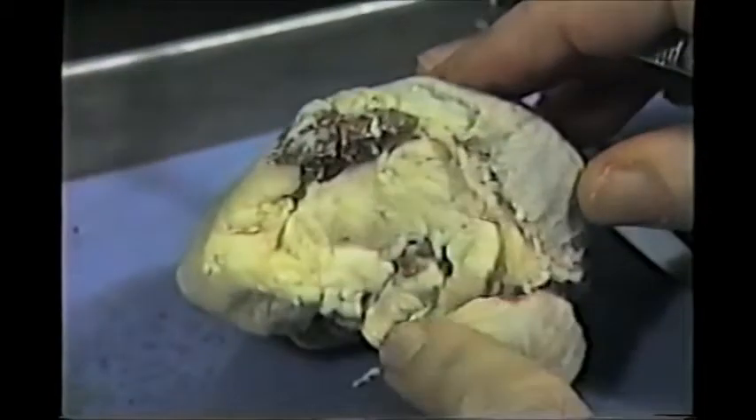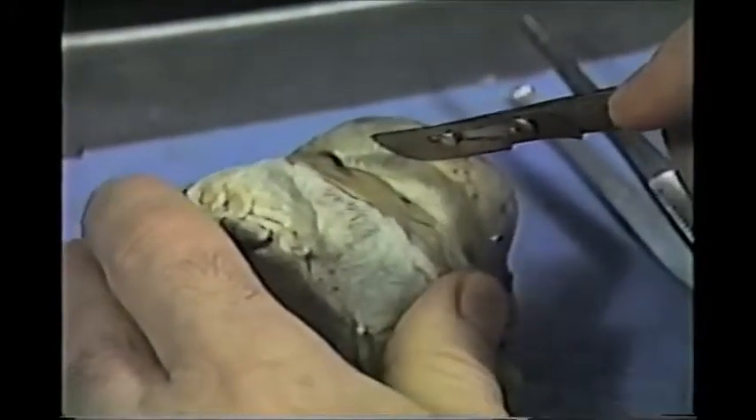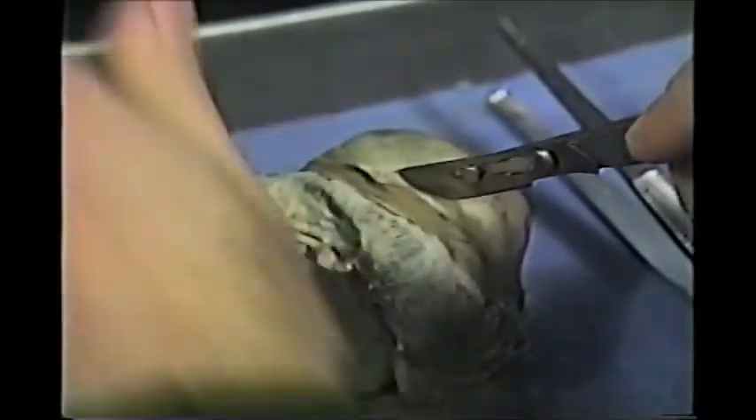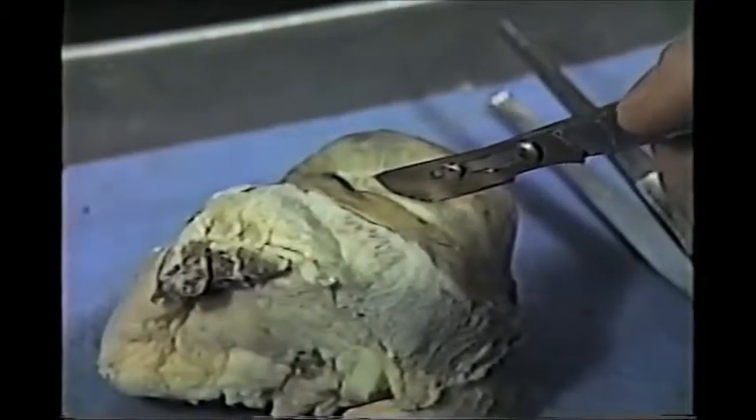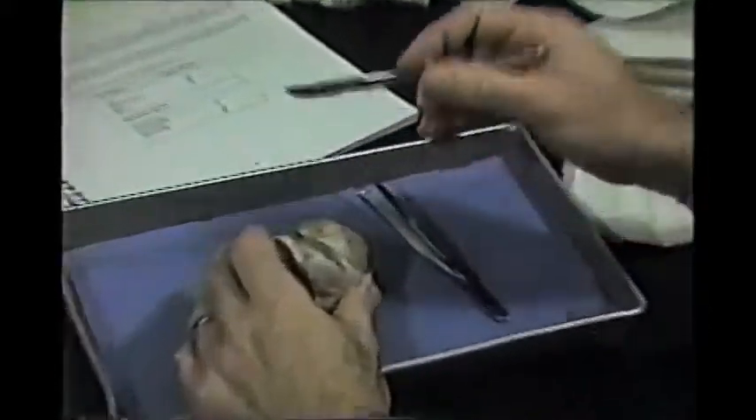When you dissect, you want to take a scalpel with the cornea on one end and the optic nerve at the other. You want to slice slightly behind the cornea, somewhere here — don't try to cut through the heavy muscles. In your lab book, figure 11.2 shows you where you should cut approximately. If you're off a little, it doesn't make a difference. Dare I say, you could eyeball it.